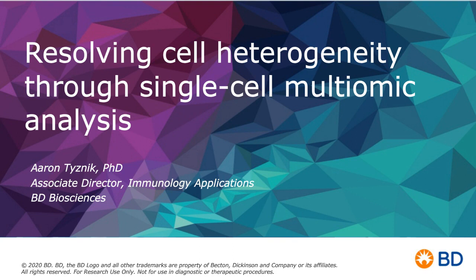And today, specifically, we're going to be talking about how you can leverage BD's technology to interrogate proteins on the cell surface, a part of the proteome. And along with that comes mRNA information that may be valuable on a single cell basis, part of the transcriptome.